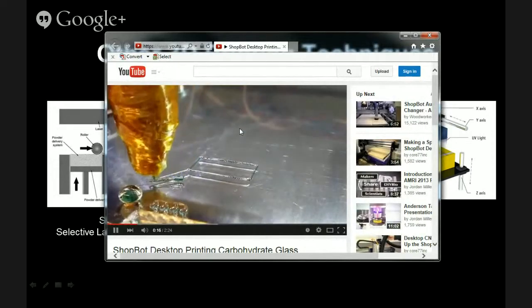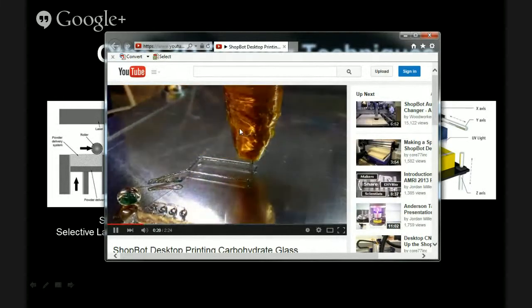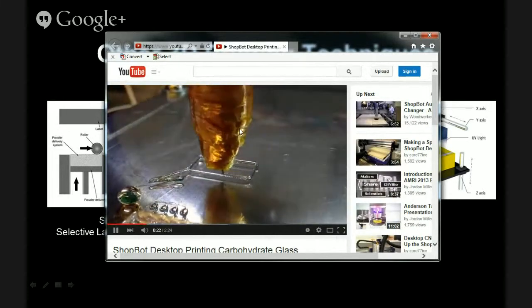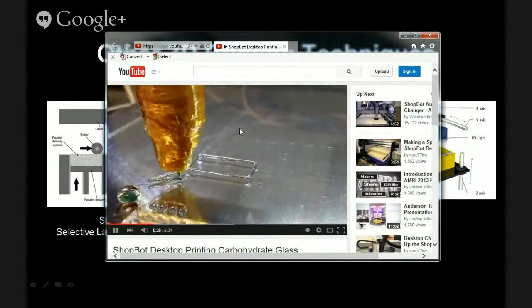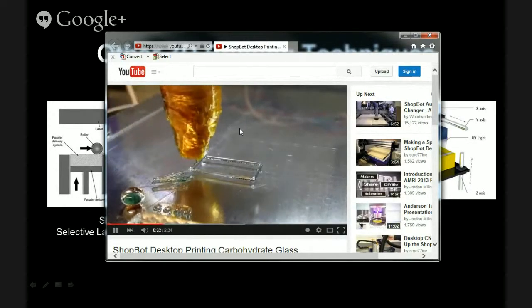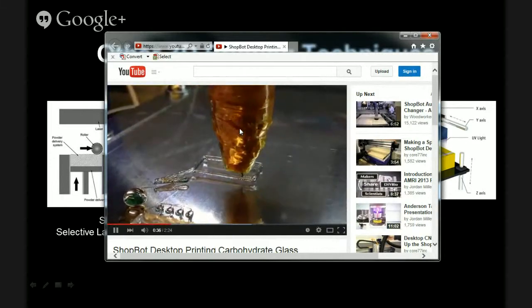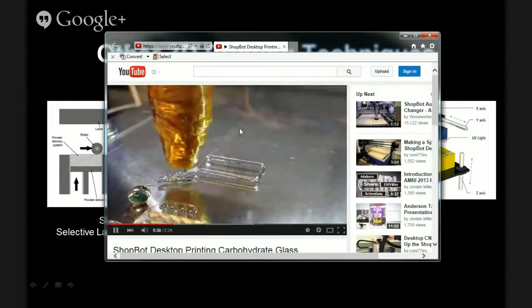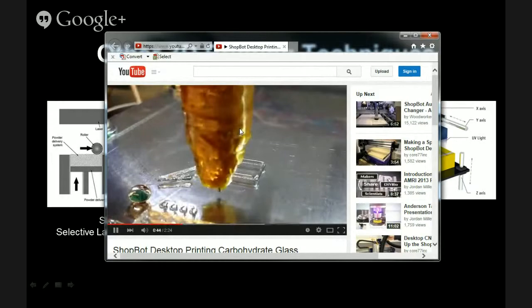It's actually quite similar to your FDM, fused deposition modeling, or your fused filament fabrication in a lot of ways, except that printing a liquid structure like this is a little bit more difficult for a number of reasons. But they've engineered this material so it's quite plastic. You can see right now it's going around printing some walls for what will function as a vessel here.